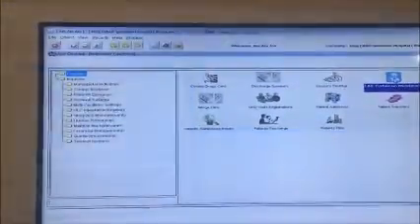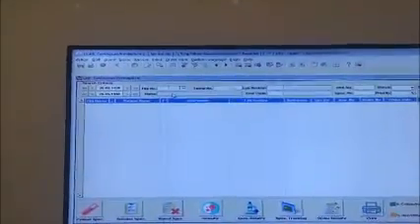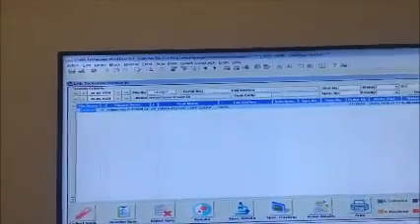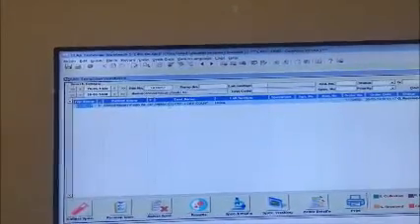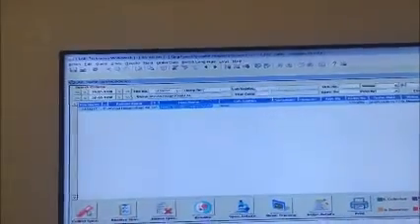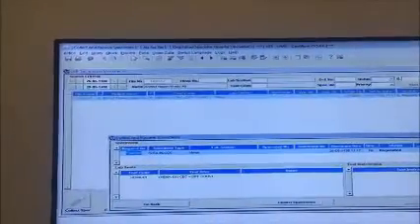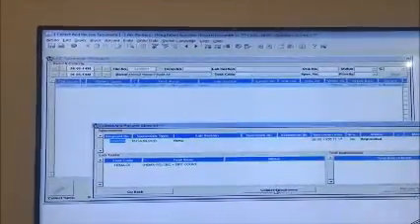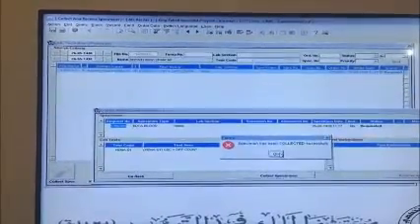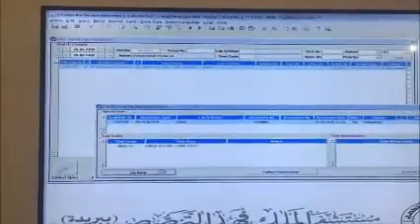From the workbench, double click, insert the file number. The system will show you the order for the hematology, the CBC. What I need to do now is a collect for this patient, for this order. Click from here to verify the collection and collect. After that, the message will appear: collected successfully, and go back.